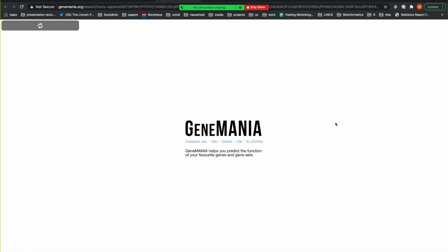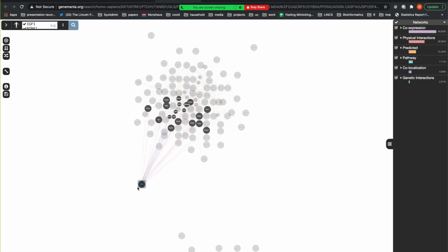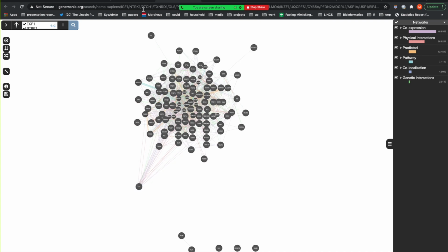That gives me a follow-up that is not just giving you the list of connected signatures, but also allows you to expand your analysis. So anyway, that's Gene Mania, the enriched module that was enriched by these query genes that I submitted.